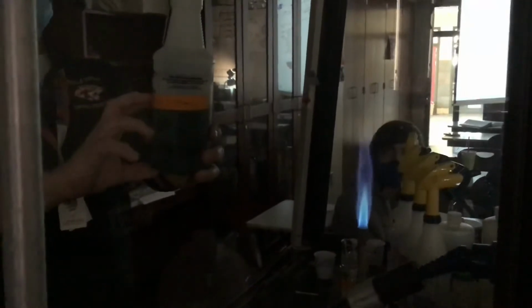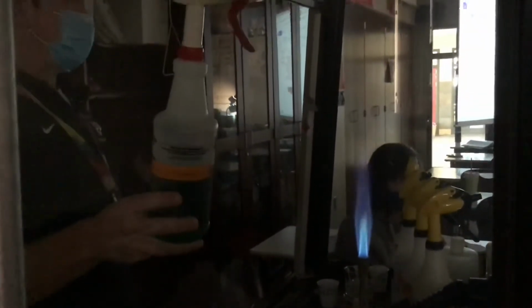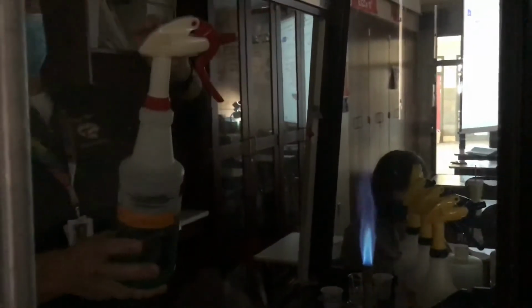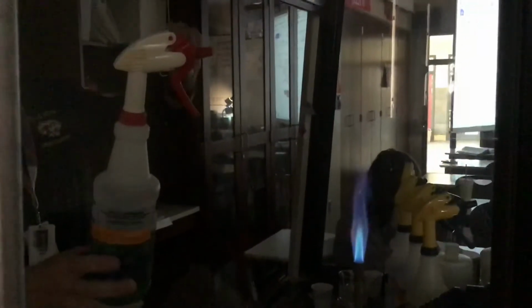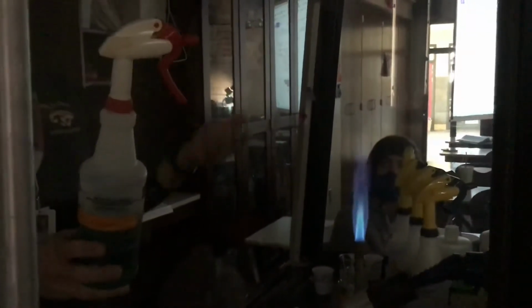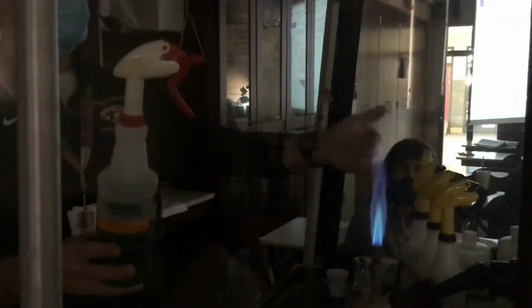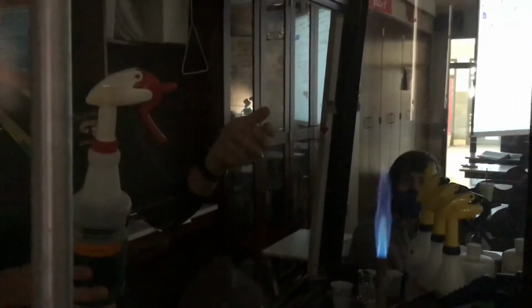I also took some of the copper solution and added it to some ethanol. Now, ethanol is also known as ethyl alcohol, and if you go to a gas station, you'll see the pump says 10% ethanol inside of your gas. Well, ethanol is very flammable, so when I spray this bottle across the top of the Bunsen burner, we should see it burn really well, and we should see the copper color emitted as well because copper is dissolved in here. So this is the part that got me burned yesterday when I did this, so let's see if it works.